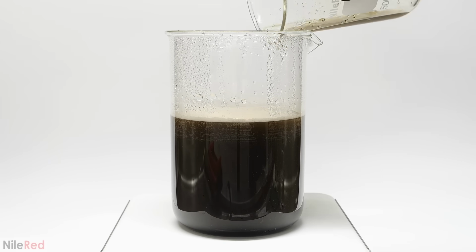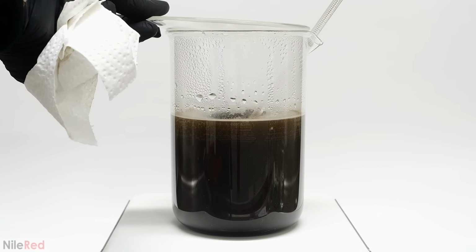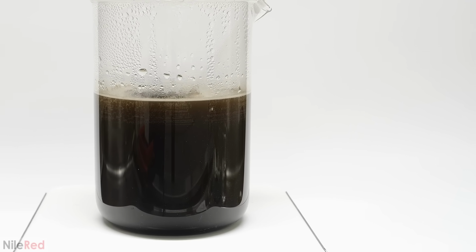I then washed out the beaker with a bit of water to make sure that I transferred everything, and I added a thermometer. I now had to keep this at 85 C, and even though it didn't look like much was happening, it was the most important step. In the other one, the cotton had just been dissolved, but here, it was actually getting chopped up.